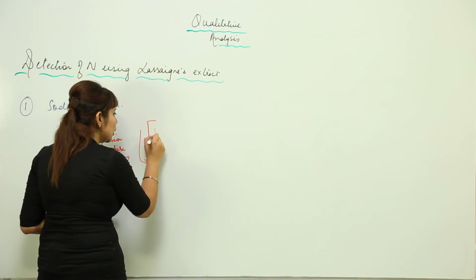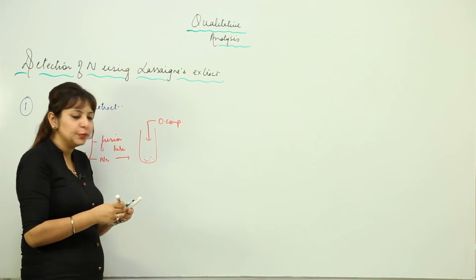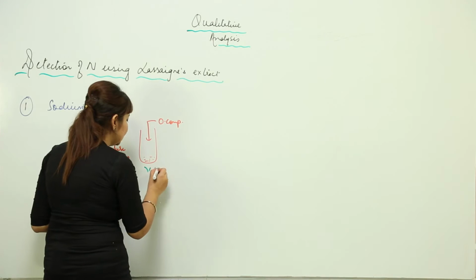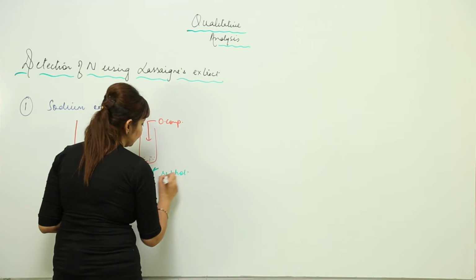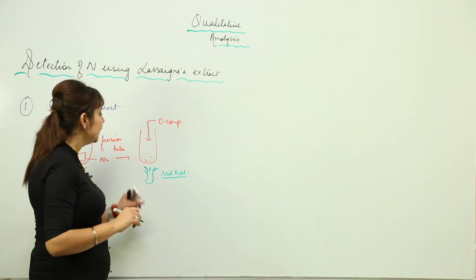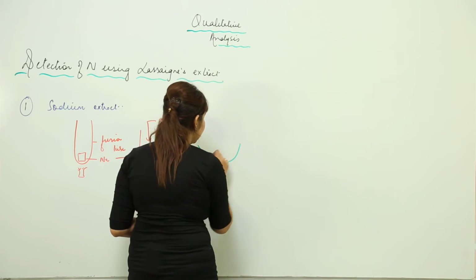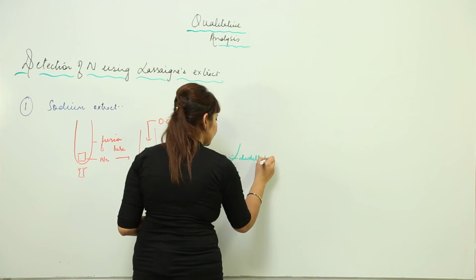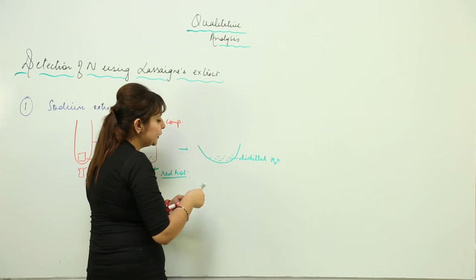Now we add an organic compound to it, right? The quantity of organic compound which you add should be low. So we add it and we again heat it. We heat it strongly, till red hot. And when it is heated till red hot, we stop heating. We take a china dish in which we take distilled water, and we break this fusion tube into this distilled water.